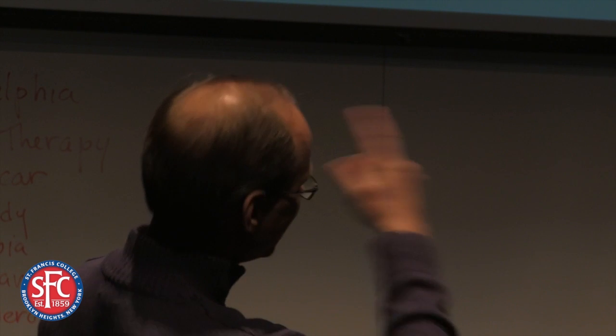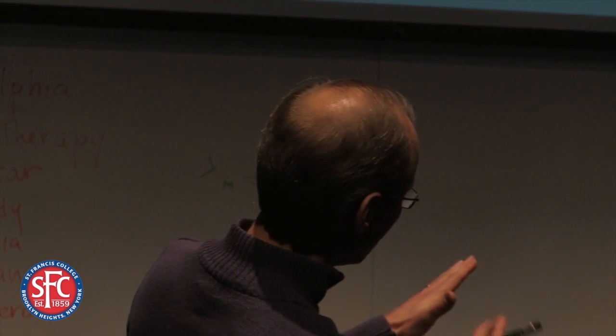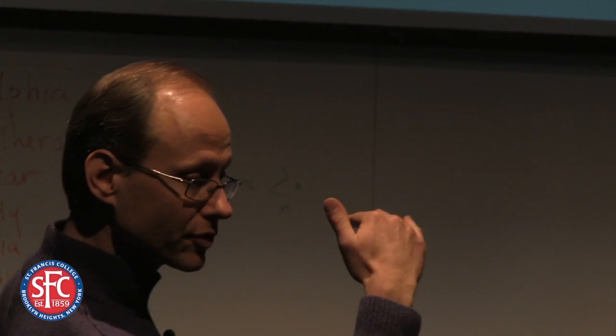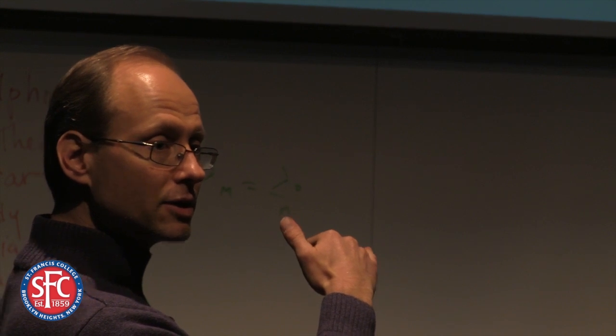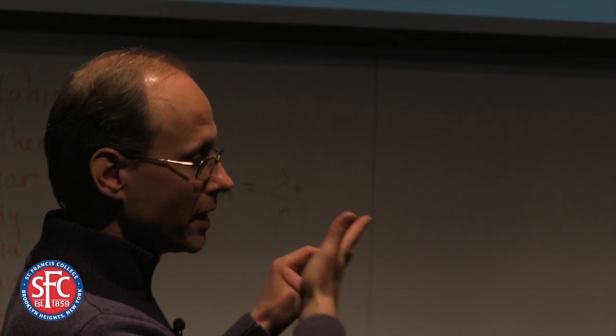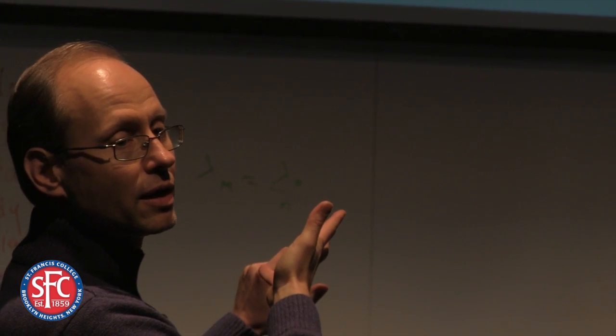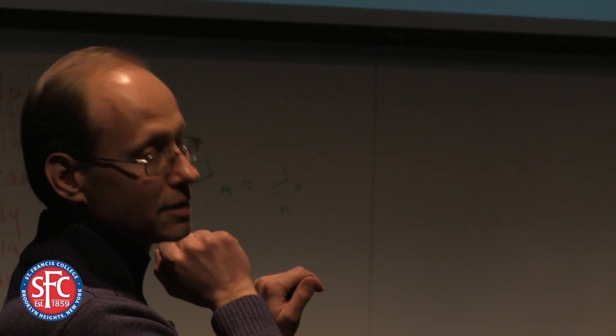And you can compare the thermodynamics of a small molecule binding to the minor groove on a double-stranded DNA that you put on a surface. The minor groove is what? When the double helix winds up, there are two grooves in there that you can kind of see the bases through. There's a major groove and a minor groove. And small molecule compounds oftentimes will interact with the edges of the bases by accessing them through the minor groove. So you could have a sensor maybe for small molecules. Absolutely.